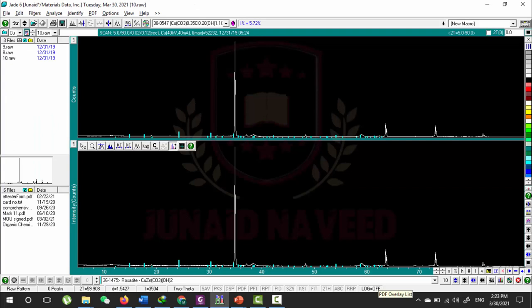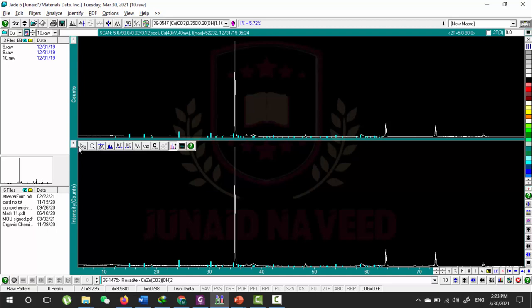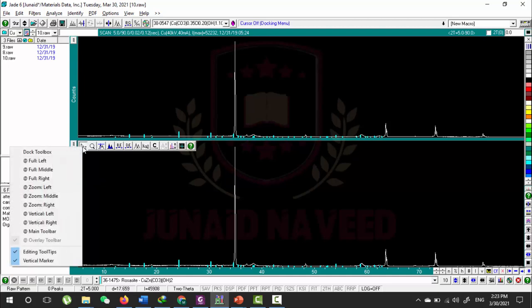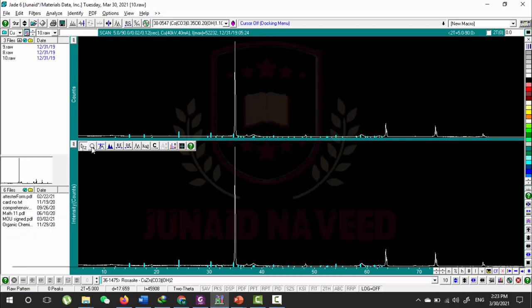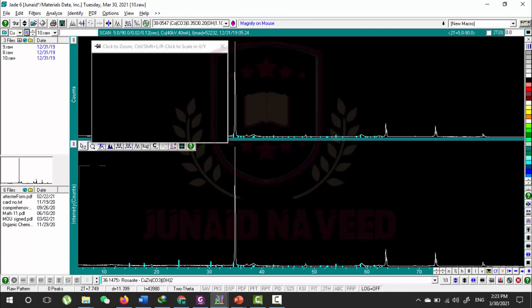Let's explore this option in the main JADE software. As you can see, one of the patterns is opened in my JADE window. The first button is basically the default state. If I click again, this will open the docking options.